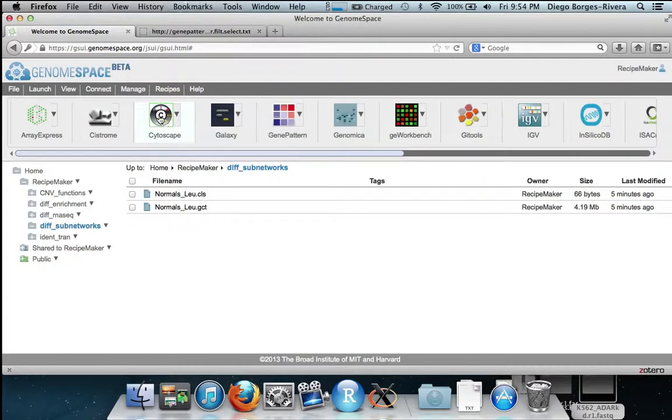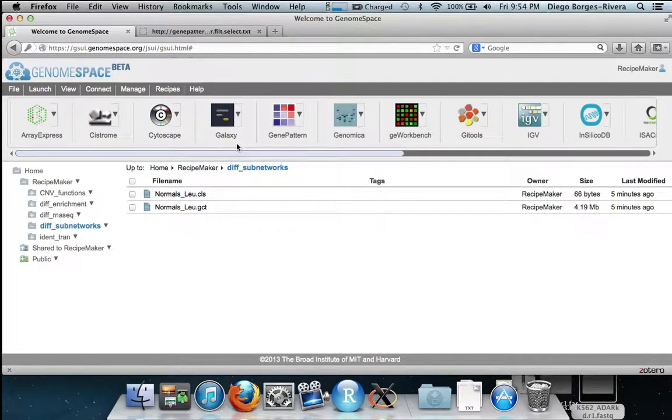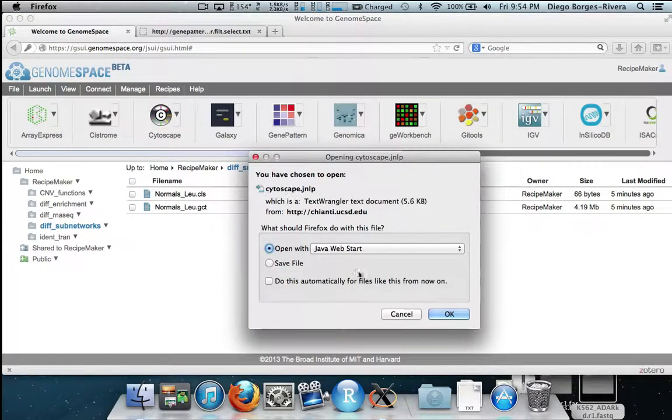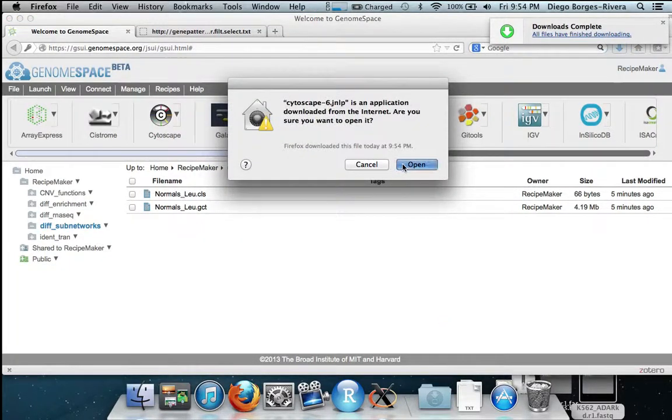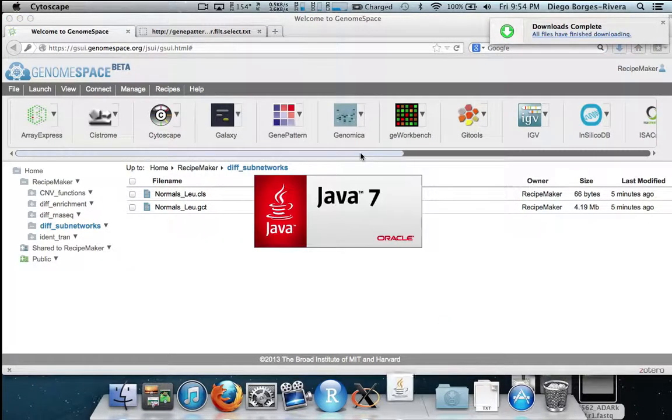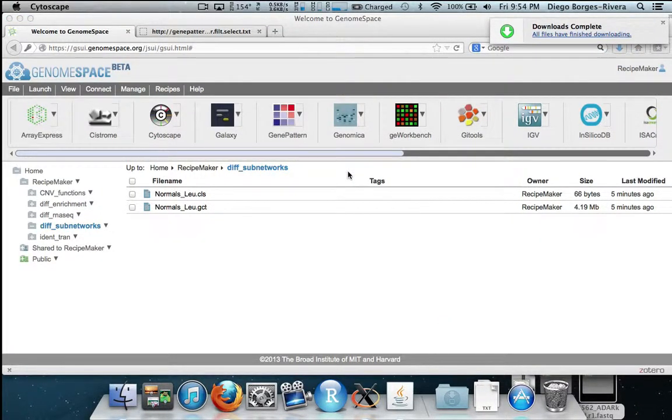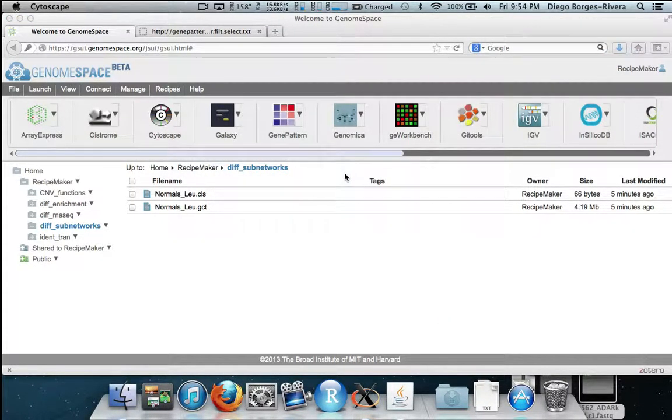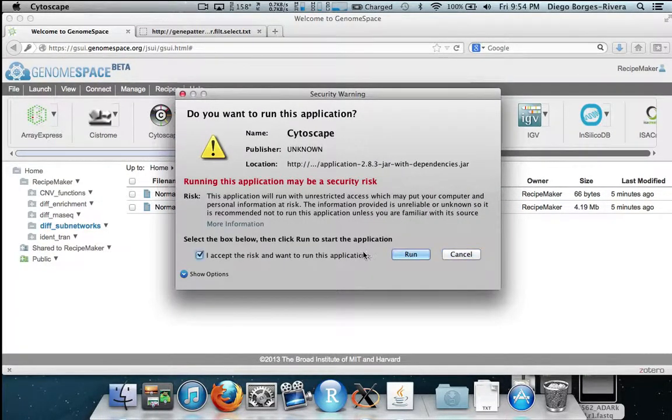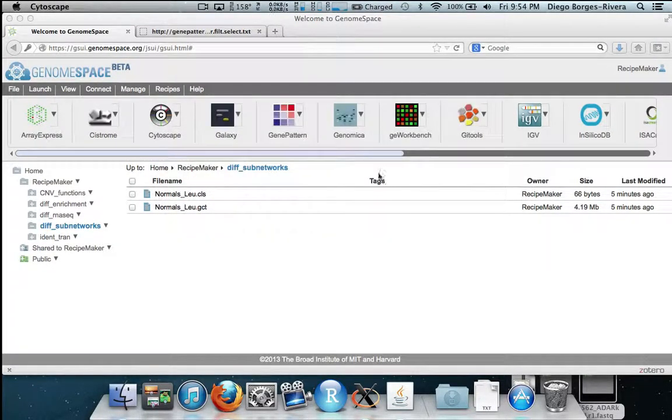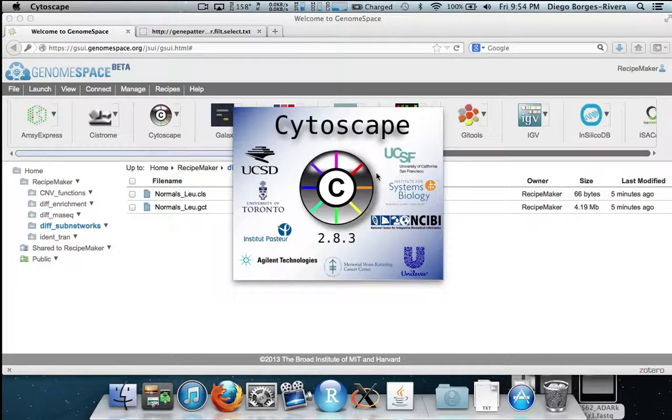Back in GenomeSpace we hit the Cytoscape button in order to launch the Cytoscape application. If you have never used Cytoscape before it will automatically download and install the application. In this case I have used it before so it will simply run.